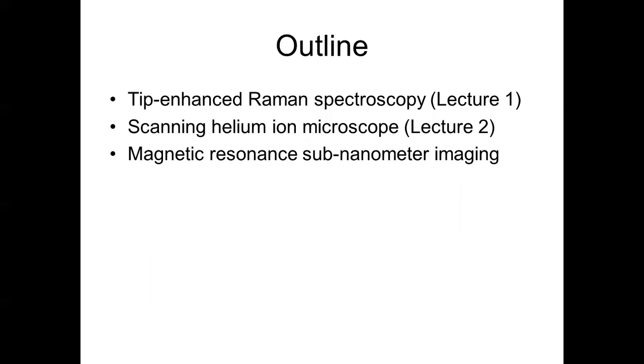I think they were interesting, and certainly the first one and the last one were pretty interesting, in that we see the utility of the AFM. I do think that a conventional thing that people do with AFMs now is combine other scientific techniques with the AFM to give a smaller spot size.